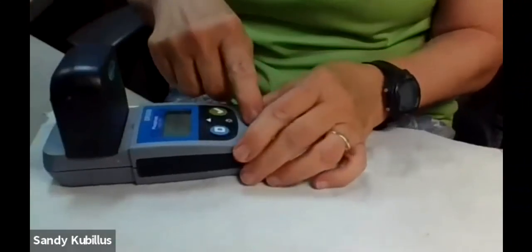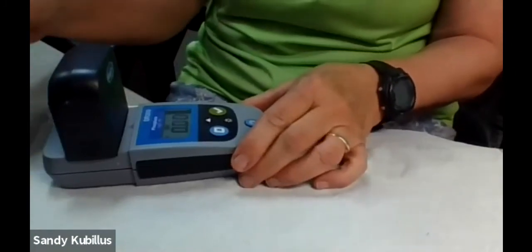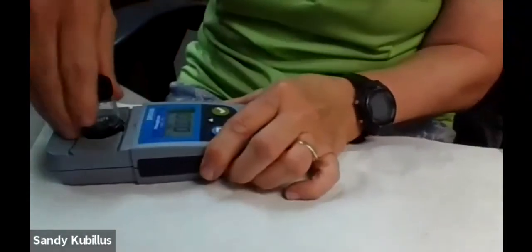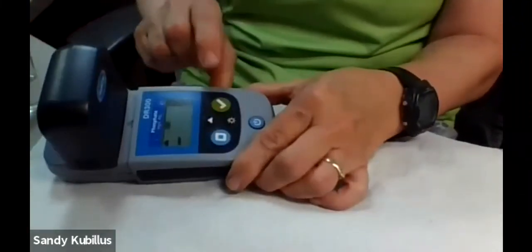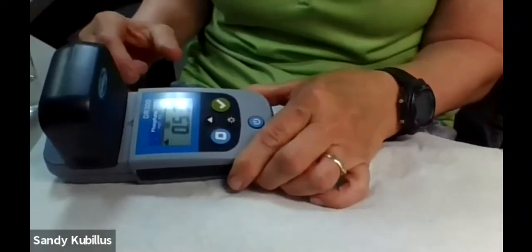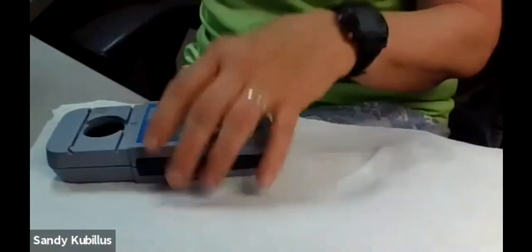Now we always want to standardize our samples first so that we know that everything we're seeing is because of the phosphorus and not because of any background coloring that there might be in the water. And then we would add the other sample, which is a test sample, and get the sample. Now this has been sitting around for a while, so it might be a little bit different, but it's reading 0.53, which actually I believe is about what we had for Willow Lake. So there's a little pocket colorimeter.